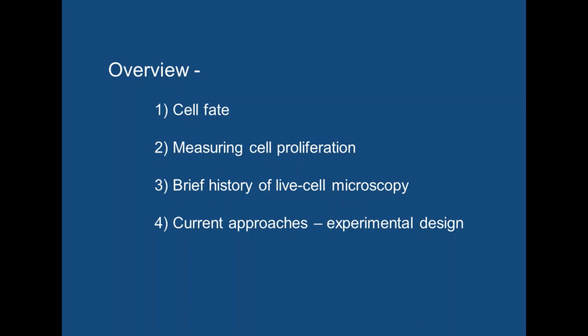So I'd like to talk to you about how we use live cell imaging to study cell proliferation in the context of both basic cell biology and in preclinical studies. And I'd like to share with you how we've introduced the Incucyte system into our existing workflow.